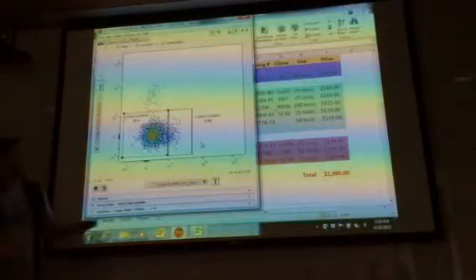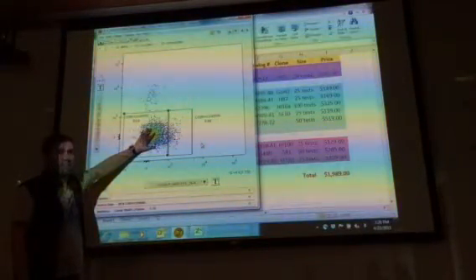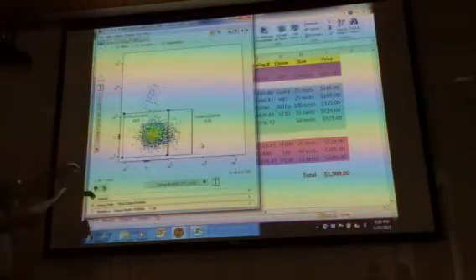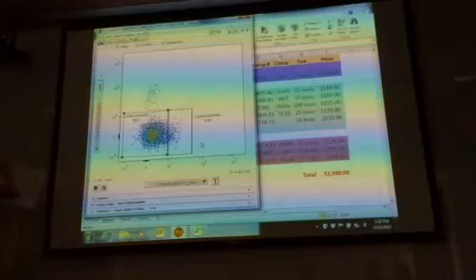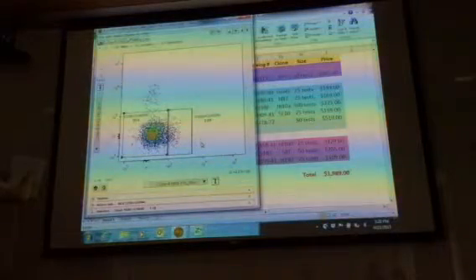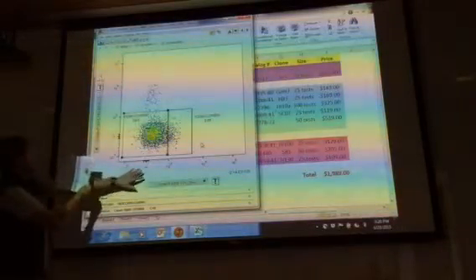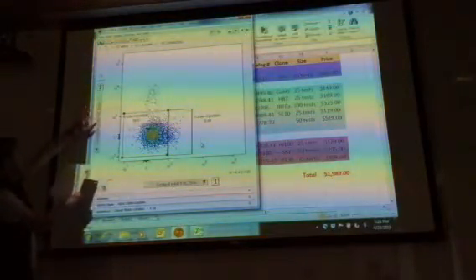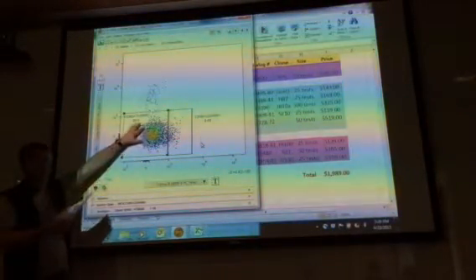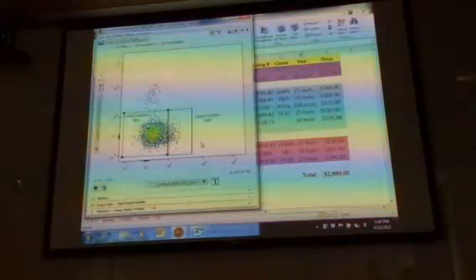But what is this population of cells here? According to this gate here, these are the CD45 positive, Lin negative. Then the CD34 positive, CD38 negatives. And then to here, this is CD90 along the bottom, and the CD45RA here. This represents our multipotent progenitor cells. So according to the sheet here, this population represents our MPPs.